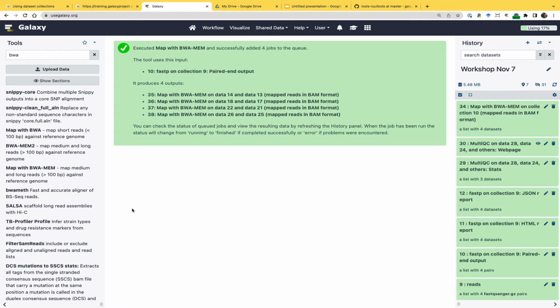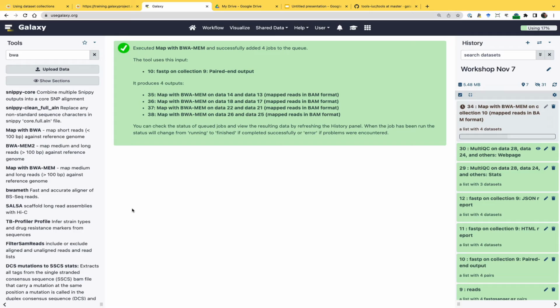Okay, so let's start 4 BWA-MEM jobs. So for example, when we were dealing with COVID data to analyze 1,000 samples, well, the COVID genome is small, so it's easy to map. 1,000 samples you can process in about an hour, because individual mapping jobs are short. In this case, we're mapping 1,000 reads against the entire human genome, against the entire 3 billion base pairs. But our set of reads is small, it's just 1,000 reads, so it's not going to take that much. But it will take some 2-3 minutes.